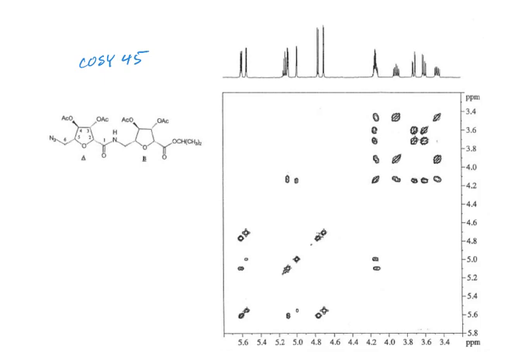And so where do you think we can look on this spectrum? What stands out to you that we could maybe assign something? One? Two. One is so downfield. One? Yep. But one is a carbon, right? So there's no proton there. Two. So we have two.